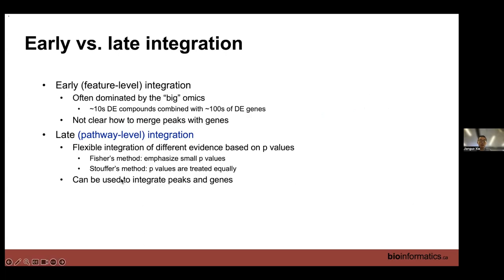And how do we integrate the p-values? There are a lot of well-established methods, such as Fisher's method and Stouffer's method, and you can also combine them. Sometimes you can integrate with weights to emphasize the stronger p-values or high-quality datasets. This is used in meta-analysis.